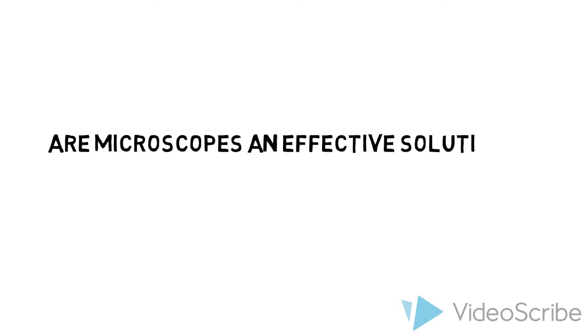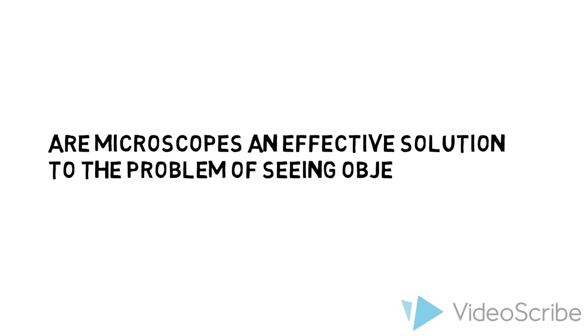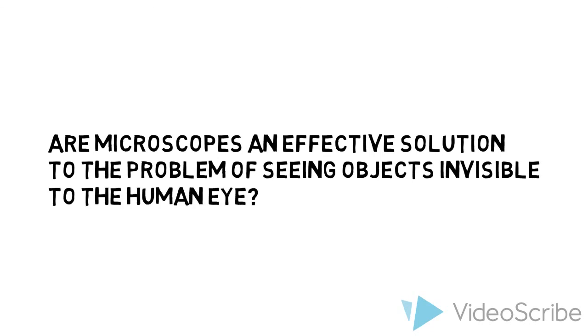The solution that optics discovered for the age-old problem of seeing extremely small objects is an effective one. Compound microscopes are small, relatively cheap, and do the job flawlessly. Overall, they are a perfect solution.